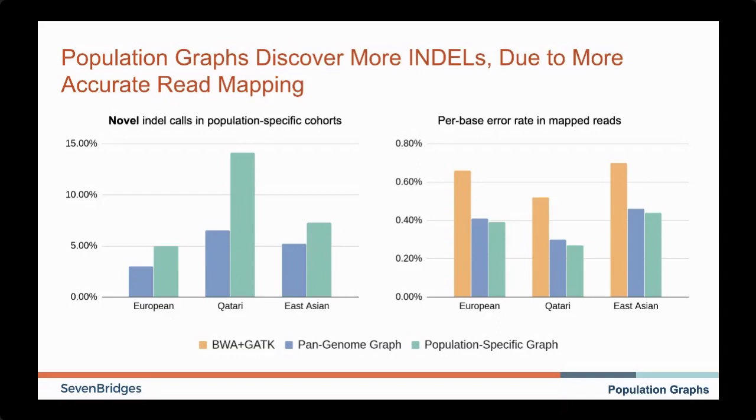So we have done all these tests, and we have a finalized method that you could just plug and play. Given your samples, we can immediately test a subset of the population and say that, all right, I'm just making up this number, but we might need like 1,000 samples to cover 85% of the diversity of this population. We can come up with these numbers easily.